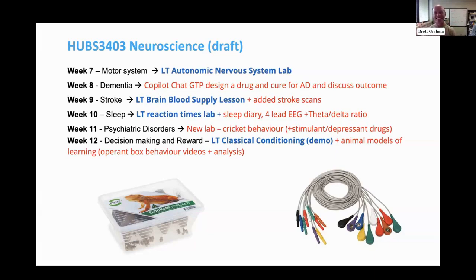And you know, they're second year students who don't like reading instructions, and then you wander around. There are some classics, where there was one group that went through the whole lab and hadn't resized the axes so they could see the data. They'd done this elaborate experiment that took nearly half an hour, and I walked over and they didn't even know. I said to them, guys, you must just think you're so lucky and good. Fortunately, they hadn't even seen if the transducers were working. But that's a great learning experience. Yeah, that's learning. You've always got the backup of, as Brian said, the example data that you can give them if you need to. You hope that those sort of profound moments will really shape their futures.